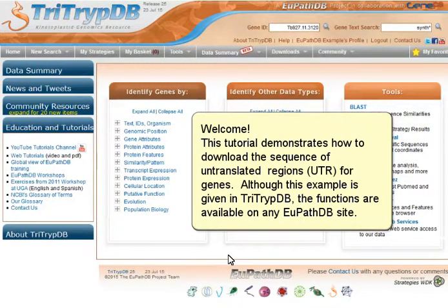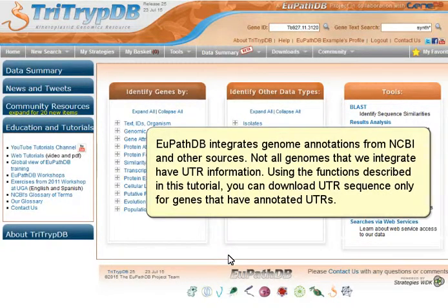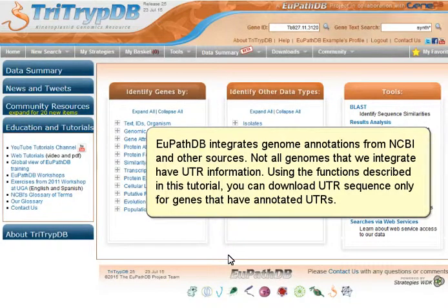Welcome. This tutorial demonstrates how to download the sequence of untranslated regions, or UTRs, for genes. Although this example is given in TriTrypDB, the functions are available on any VEupathDB site. VEupathDB integrates genome annotations from NCBI and other sources. Not all genomes that we integrate have UTR information. Using the functions described in this tutorial, you can download UTR sequence only for genes that have annotated UTRs.